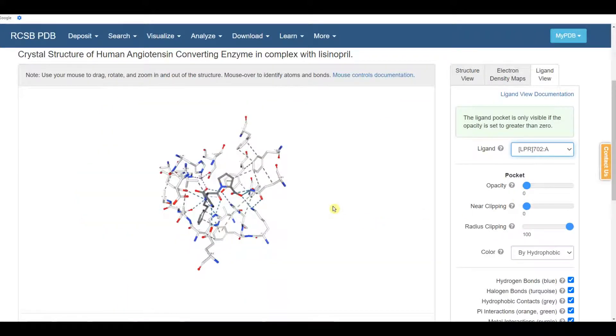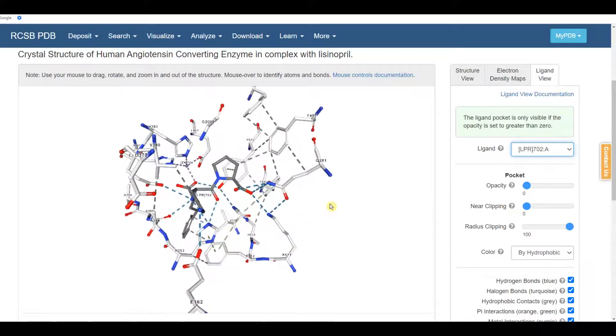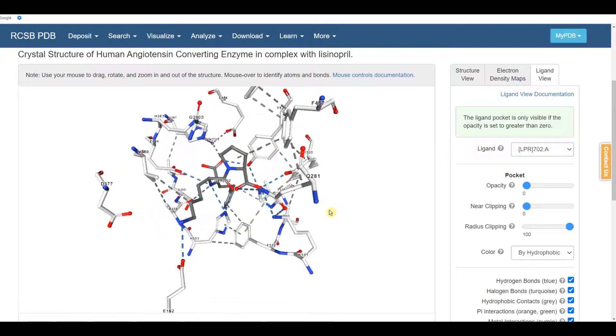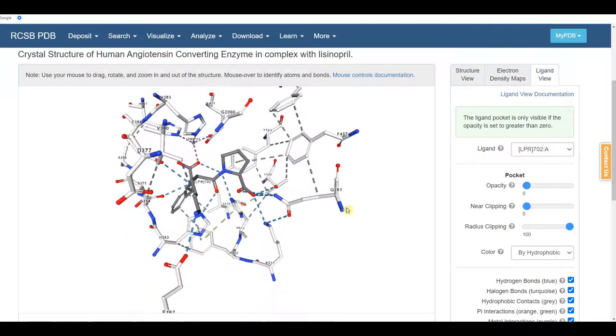Great! Lots of stuff disappears, and we only see the vital parts for these interactions. So let's scroll in to zoom, and you'll see lots of lines. Most of these lines are between the atoms in lisinopril and the surrounding protein.